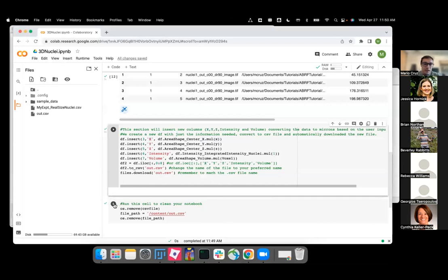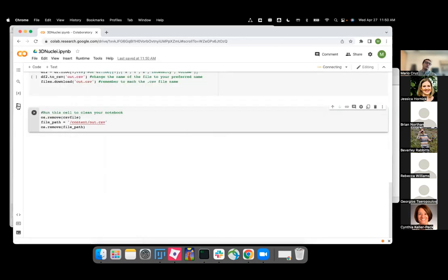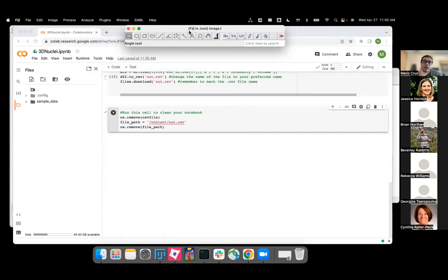After that, we can hit this button, and what's happening here is just erasing these files from our Colab. So you just clean data. At the end, we can use Fiji, that's another software, just to see the results of our segmentation.